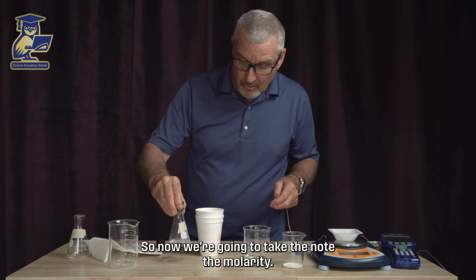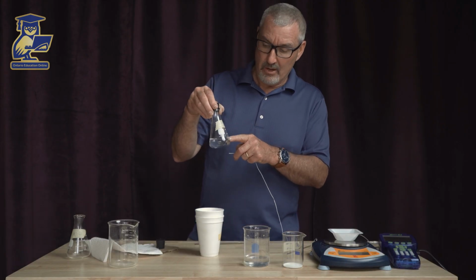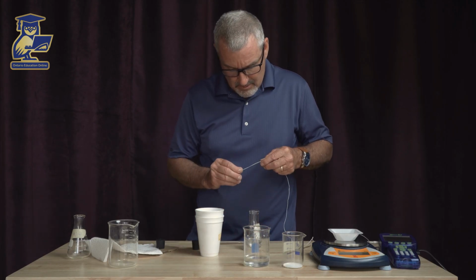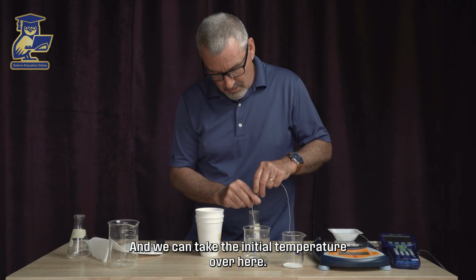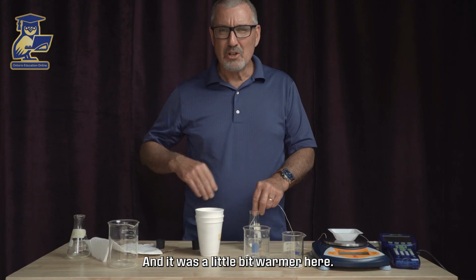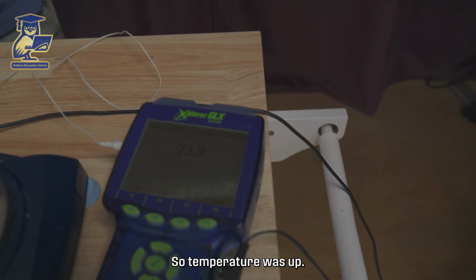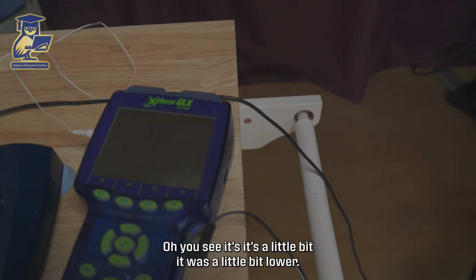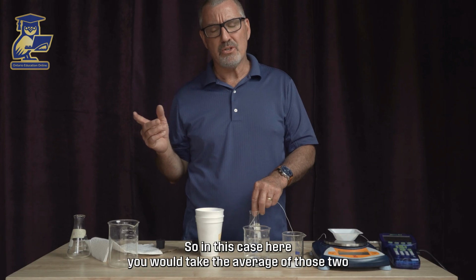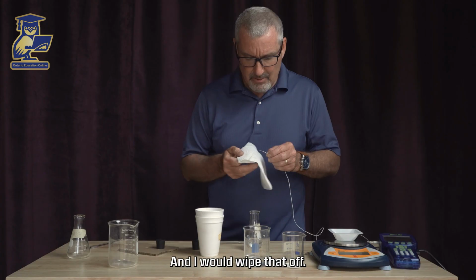All right. So now we're going to note the molarity. So same volume. It's going to be our 50 mils here. We can take the initial temperature over here, and it was a little bit warmer here. I held up my hand, and my hand's a little bit warm, so temperature was up. Oh, you see, it was a little bit lower. So in this case here, you would take the average of those two as an initial temperature, and I would wipe that off.